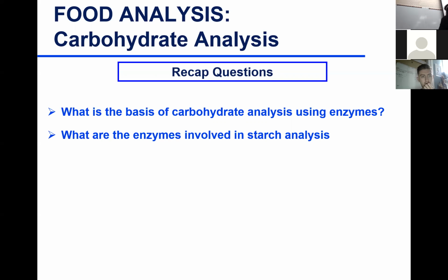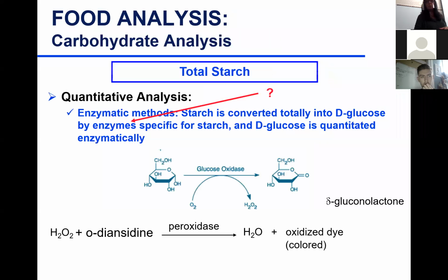Then we have to use peroxidase enzyme. And okay, so let's look at the reaction. So first of all, we use glucose oxidase to generate peroxide, and then we use peroxidase to oxidize a dye. So we get the peroxidase helping the peroxide oxidize a dye to give you an oxidized dye that you can measure using a spectrophotometer. Okay, so this is the coupled reaction.